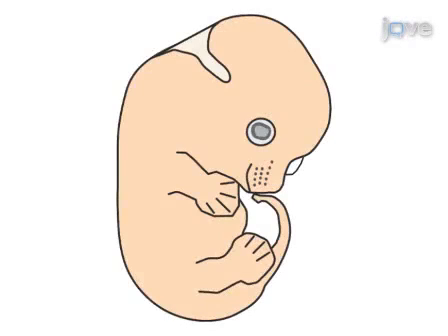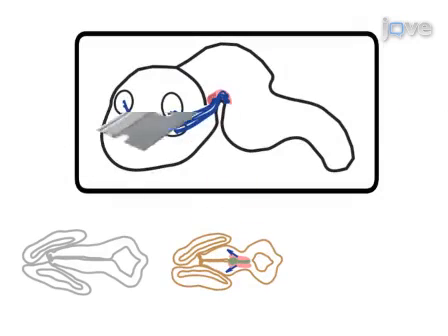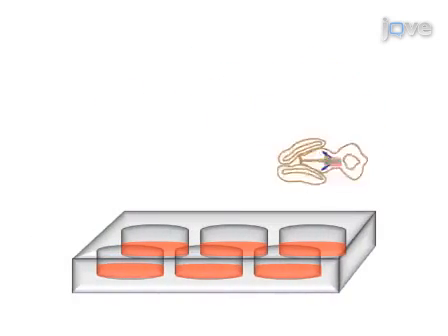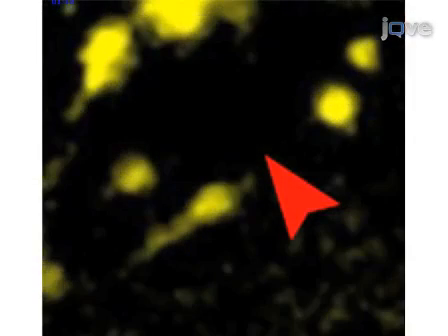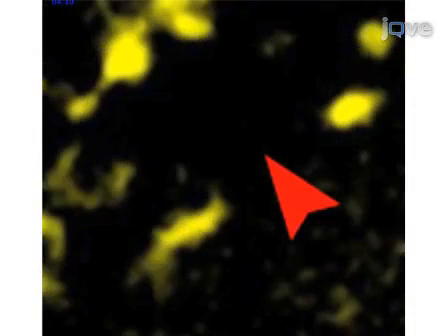This is accomplished by first dissecting the embryonic brain. Then the brain is embedded into low melting agarose. The third step is to section the brain slices using a vibratome. The final step is to choose the right brain slice for culturing and time-lapse imaging. Ultimately, time-lapse imaging and immunofluorescence microscopy are used to show the early steps of dopaminergic neurons' migratory behavior and differentiation.